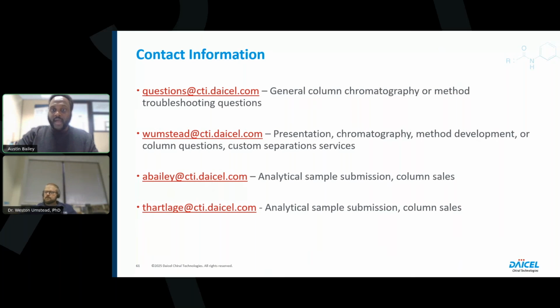So we have Stephanie Becker asking, she is working on dipeptide Fmoc starting materials that contain both L and D isomers and their corresponding allo forms. I've already tested amylose, cellulose, and QNAX-based chiral columns, but I'm still seeing co-elution. Do you have any other column chemistry or stationary phase recommendations that might better resolve these stereoisomers? That question has been forwarded to you, Wes, so you can see the entirety of the question as well.